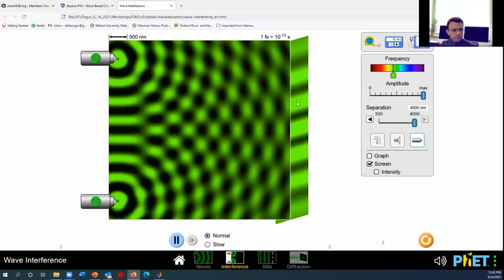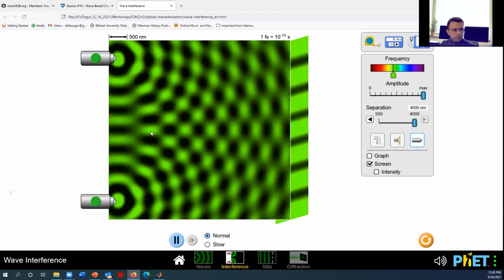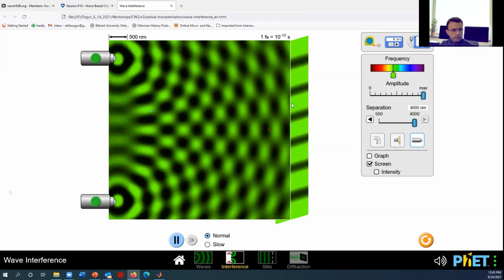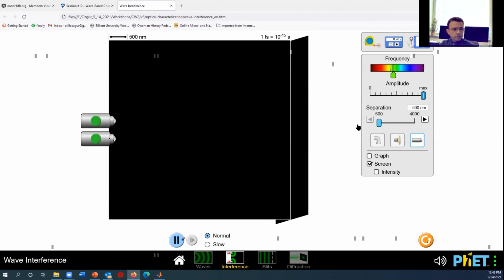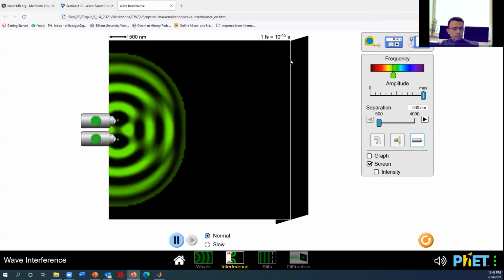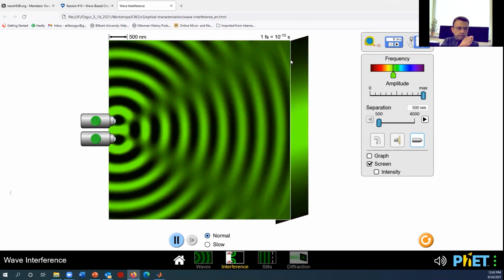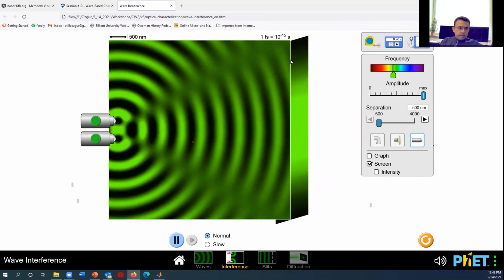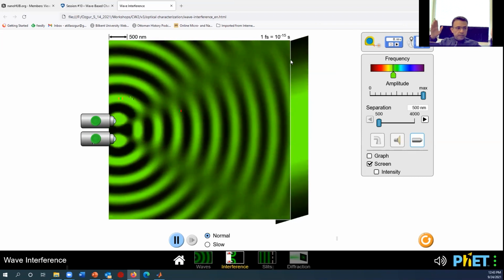And if you look at the first diffraction order again, I'm looking at all the time this angle here between this axis and the first appearance of this diffraction order. So it's much smaller, right? Just comparing the two. So in general, the student can have an idea, okay, if these diffraction planes are close to each other, then the angle is increasing. There's an inverse relationship between the two. And they can also understand the other thing with the wavelength. If the wavelength is getting larger, that angle is again increasing.